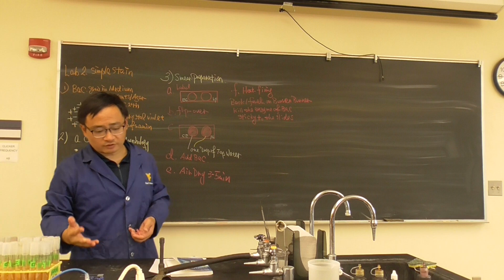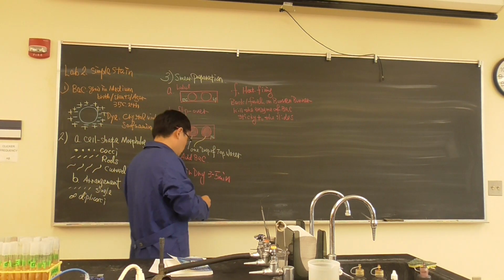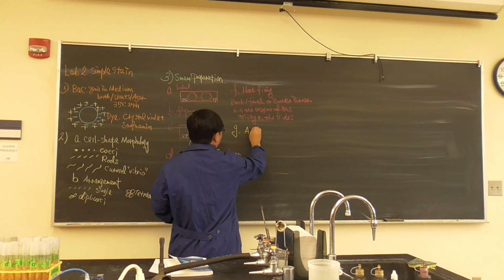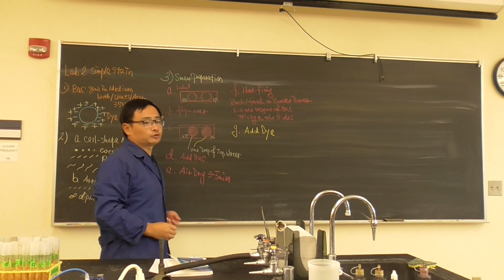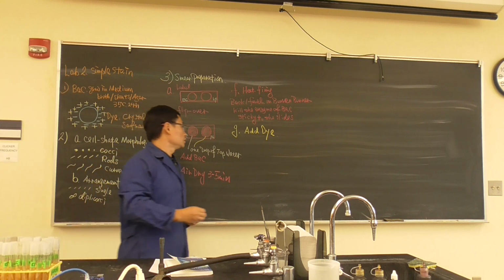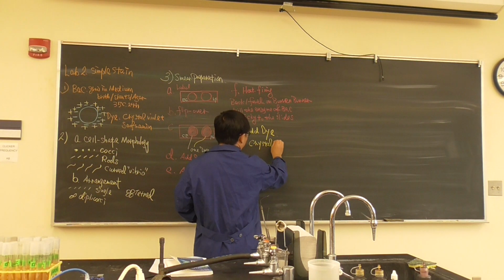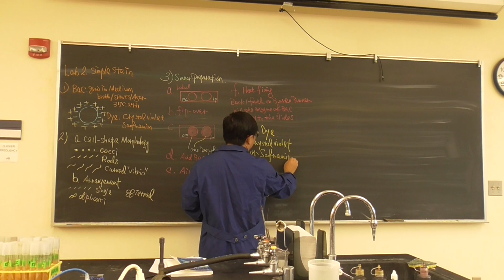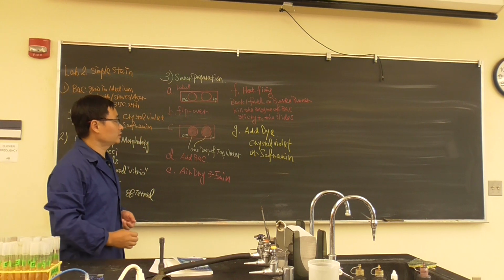Of course, you have to use a holder to hold them, so you cool down a little bit. We're going to go to a major step: you're going to add a dye. The dye you have today, I looked at your desk, you can do crystal violet or safranin. There are some other dyes like malachite green, like carbol fuchsin, we will use in the future. So you add a dye there.